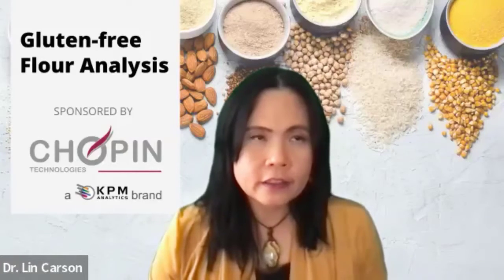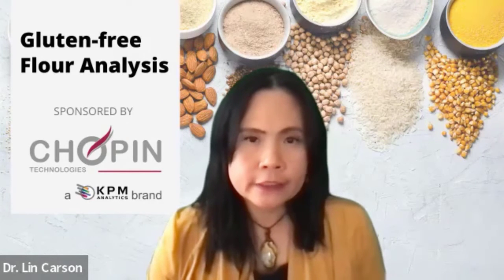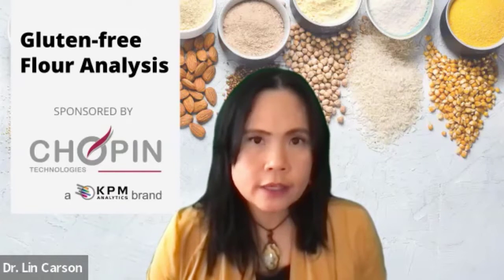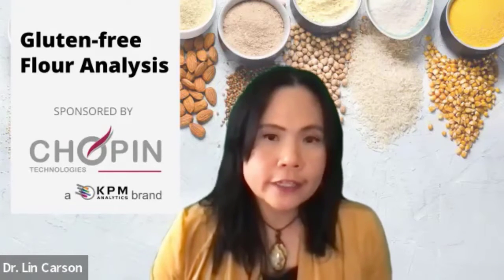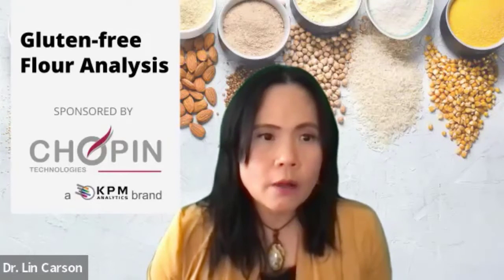Don't forget the starch retrogradation and the staling property of gluten-free is so much more significant as compared to wheat-based flours. And the farinograph is just not set up for that. The farinograph doesn't record how the starch characterizes during pasting, cooking and cooling, where the MixLab does. And that will give you a lot of information on how soft your product is going to stay over shelf life. So that is the biggest difference I see between the two instrumentation, other than the reporting. So this is why the farinograph is not as superior as the MixLab in understanding gluten-free flours.